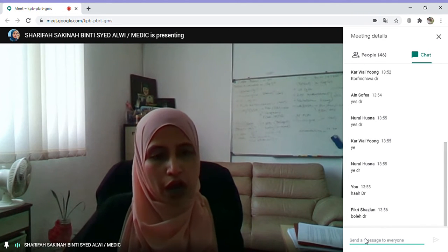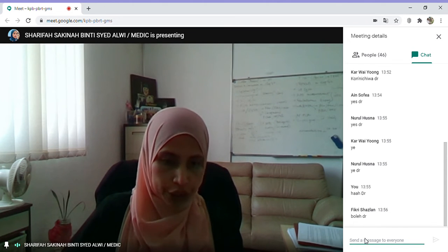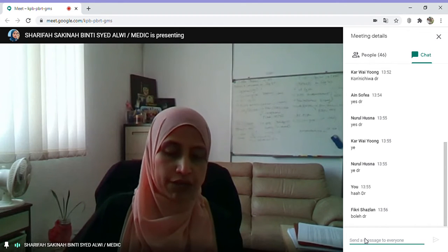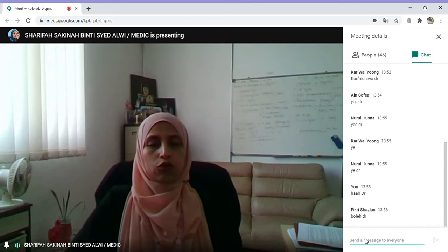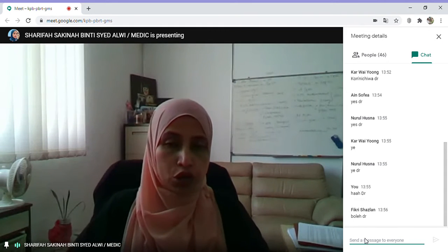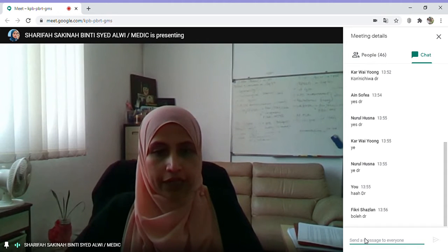All right, so how could you separate your samples of white blood cells into subpopulations, and what characteristic of the cell could you use, and how about if they had no color? We are going to answer these questions as we go along. All right, so this is the standard differentials.